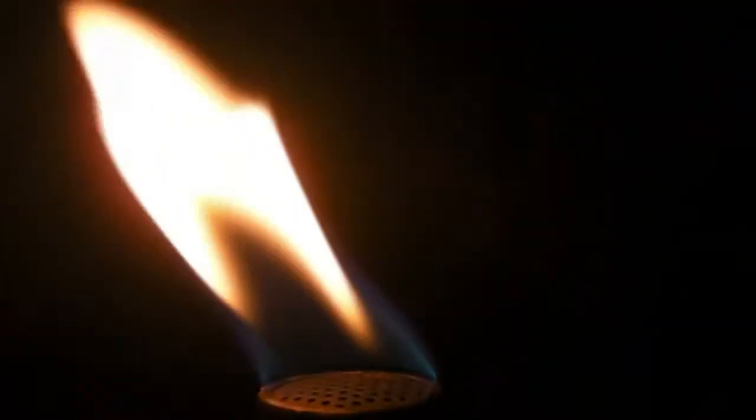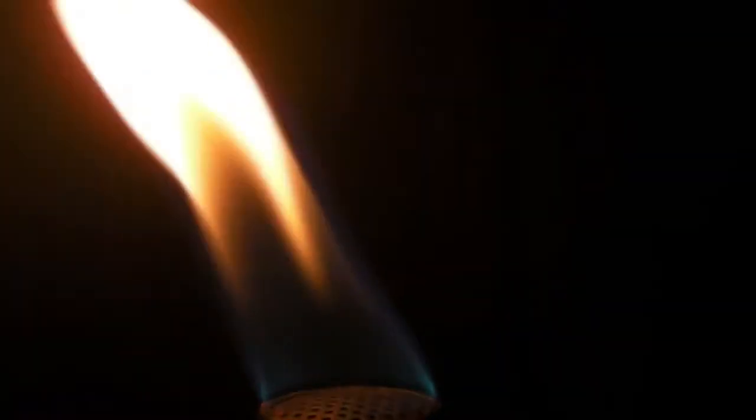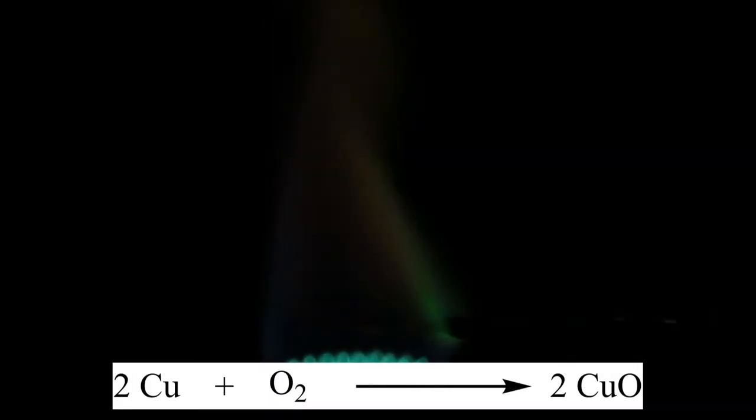First the Bunsen burner is ignited and the copper wire is heated in the roaring flame until no green flame coloration can be observed anymore. It has to be taken care that no higher amounts of halogenated compounds are in the air, like for example hydrochloric acid or solvents. Due to the heat, the copper reacts to form copper oxide.